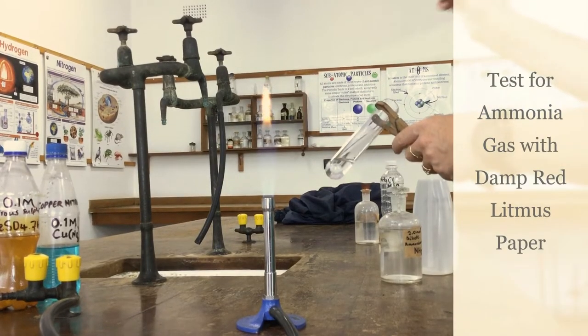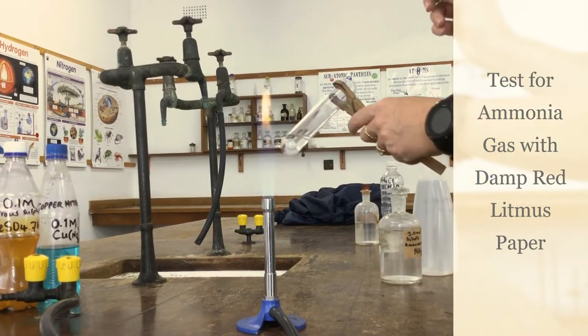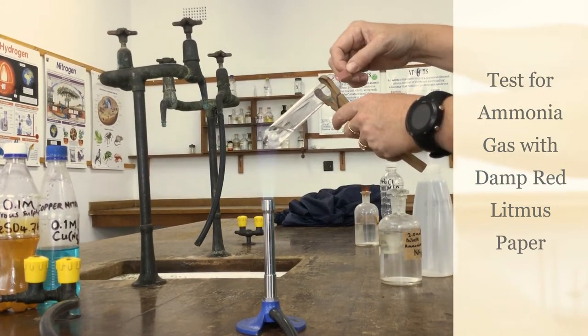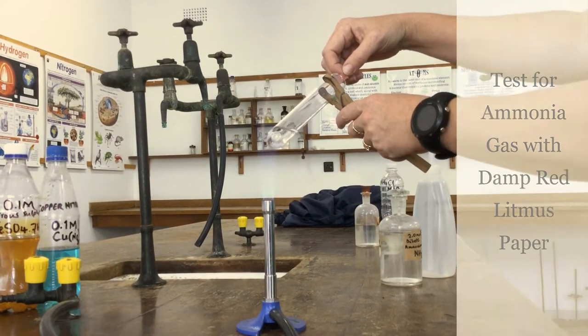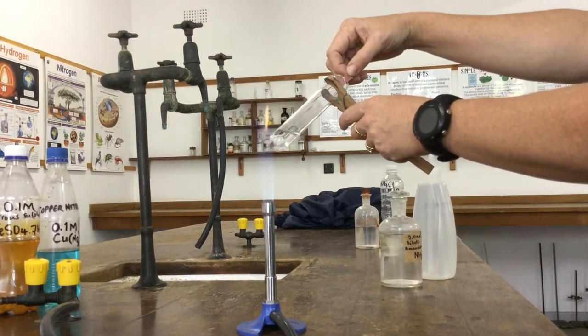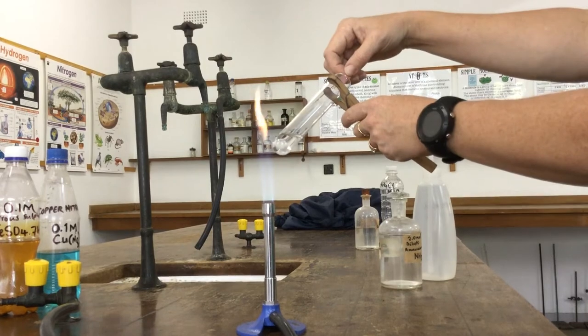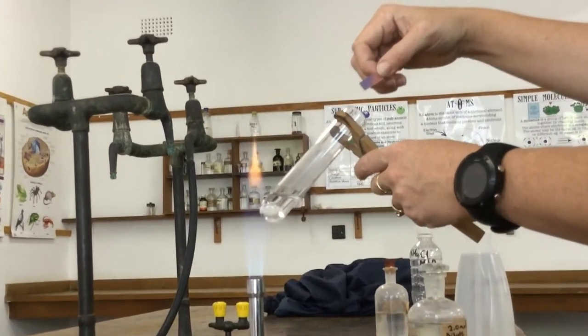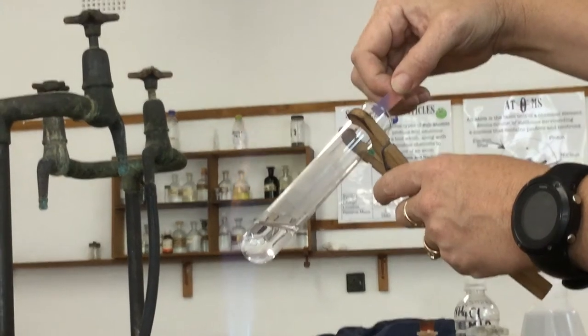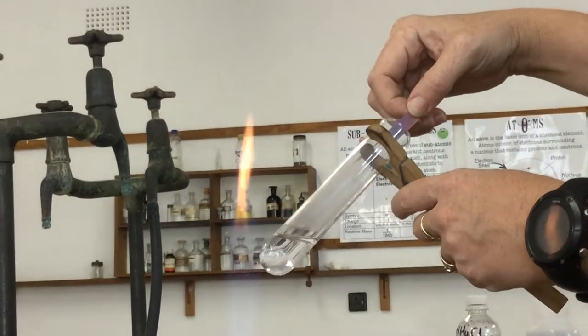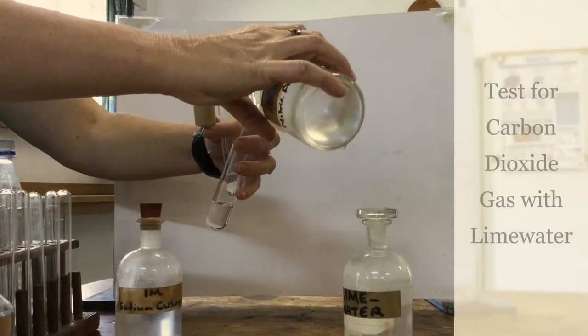Test for ammonia gas with damp red litmus paper. If ammonia gas is produced on warming, it should turn the litmus paper blue. There we see already the litmus paper is starting to turn from pink to blue as ammonia gas is produced. Add some more nitric acid.